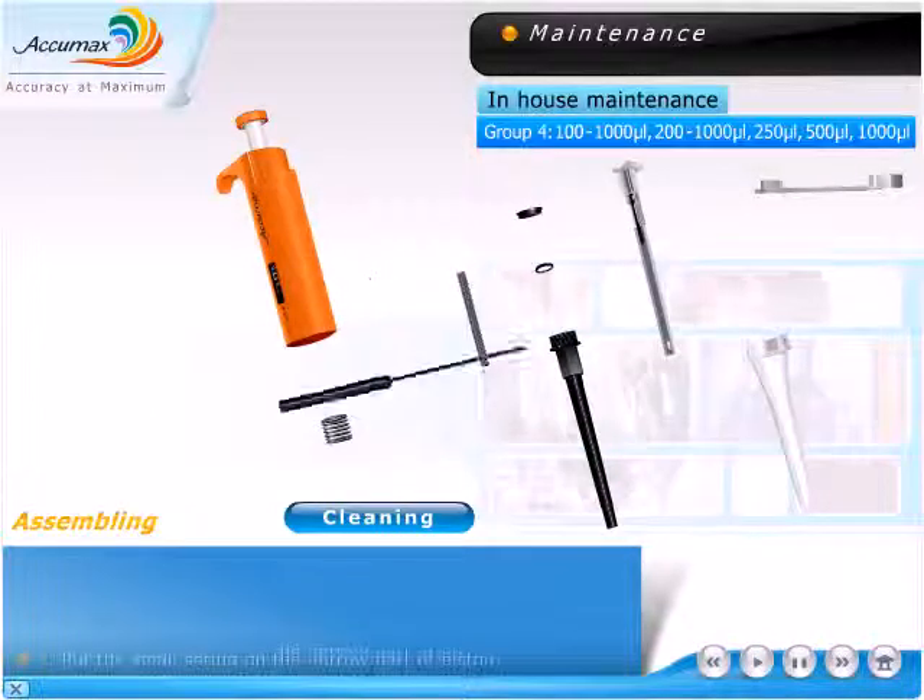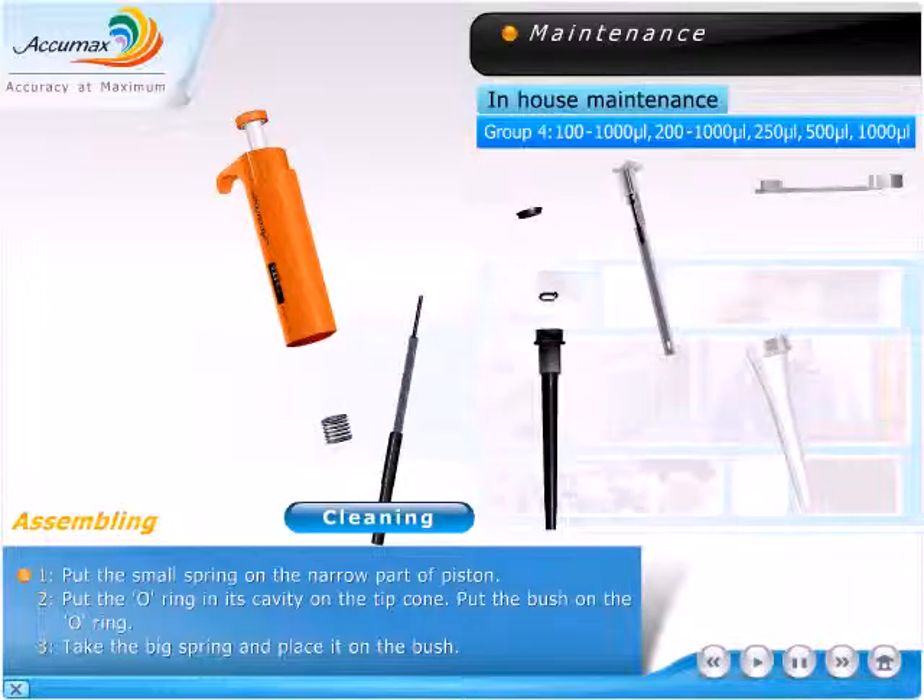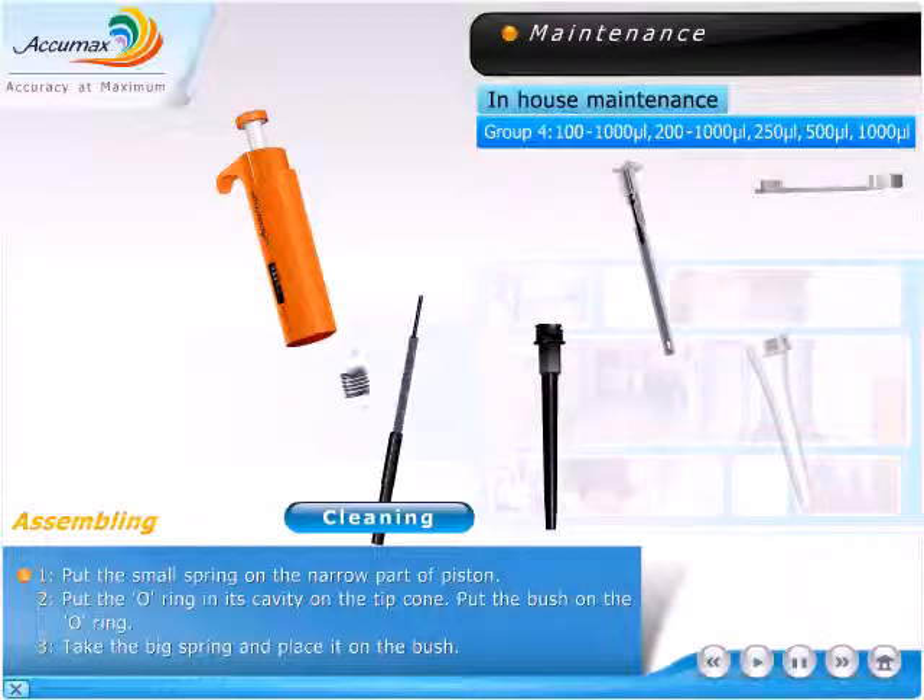Assembling. Put the small spring on the narrow part of the piston. Put the o-ring in its cavity on the tip cone. Put the bush on the o-ring. Take the big spring and place it on the bush.